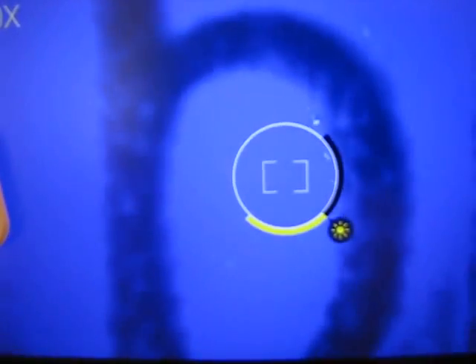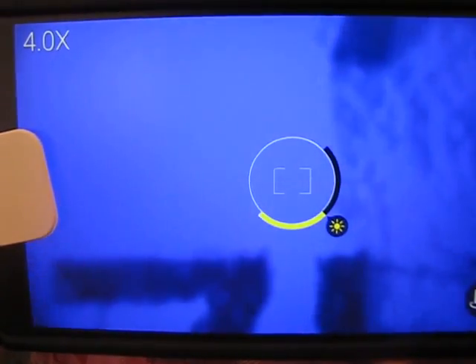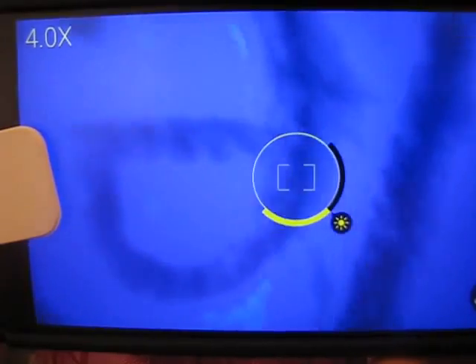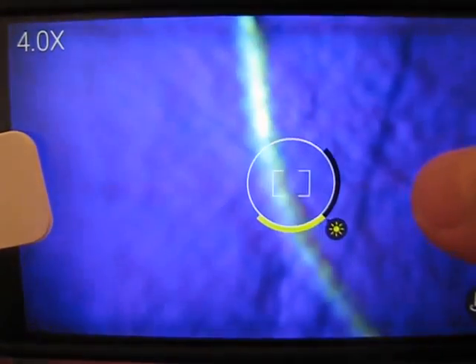Sometimes the image is blurry because the secondary camera cannot focus on the smartphone screen well enough — I apologize for that. I will include screenshot pictures at the end of this video so you can check the quality.